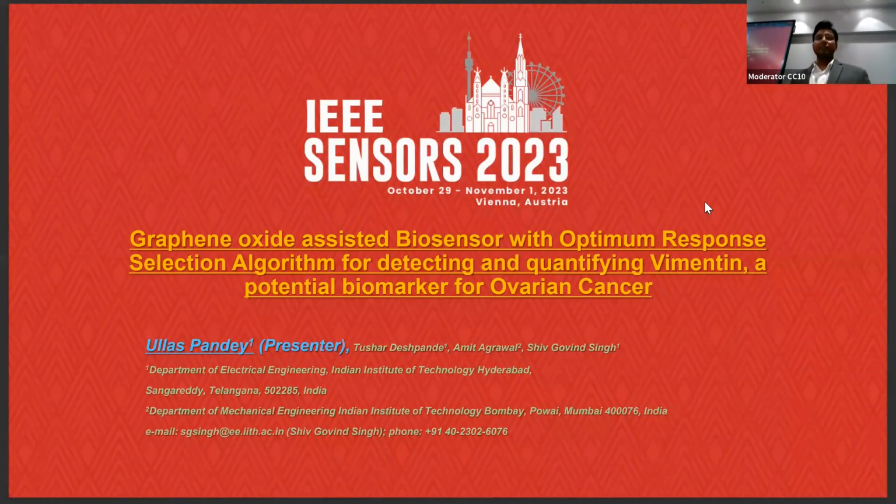So I'm basically here to present my work on Graphene-Oxide-Assisted Biosensor with optimum response selection algorithm for detecting and quantifying Vimentin, a potential biomarker for ovarian cancer. I'm Ullas Pandey and I'm from IIT Hyderabad.